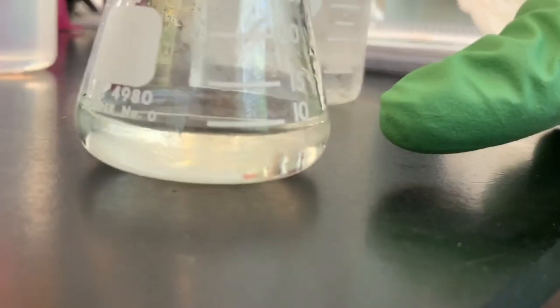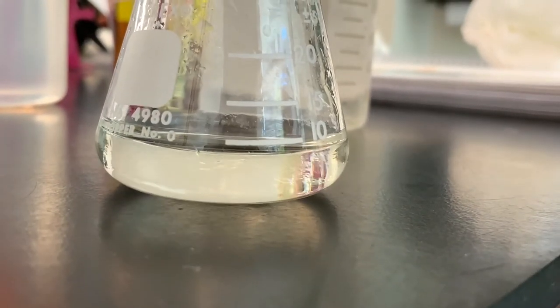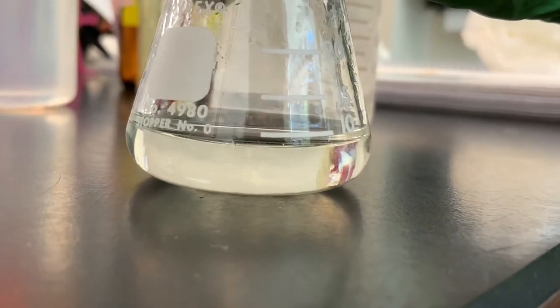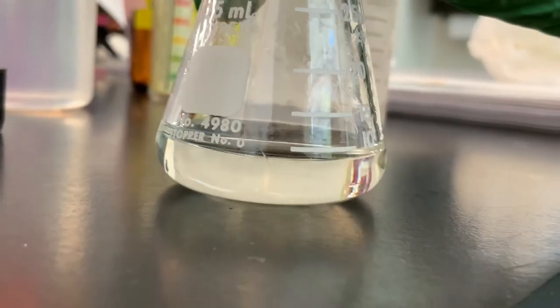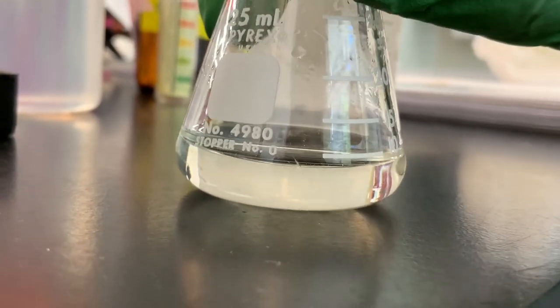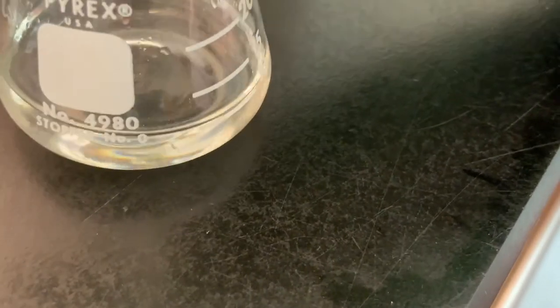You see that all happening? So that's a little bit more. You see that, they're totally combining now. There's that Schlieren again. So if I touch this, now it's room temperature because the proton transfer, this is exothermic. Do it some more, we still see that Schlieren, and we should eventually start to see the benzoic acid precipitate out of solution, but perhaps we need to put it back on ice for that to occur. But I do see some solid. I see some solid now circulating around.